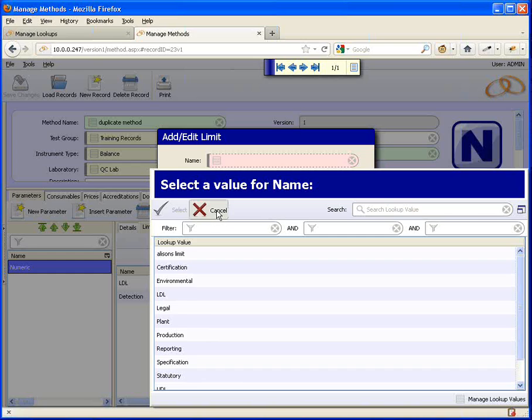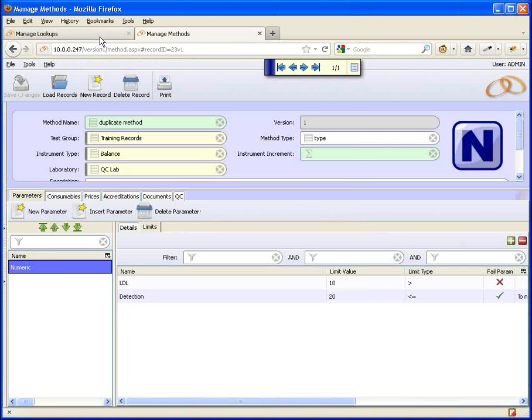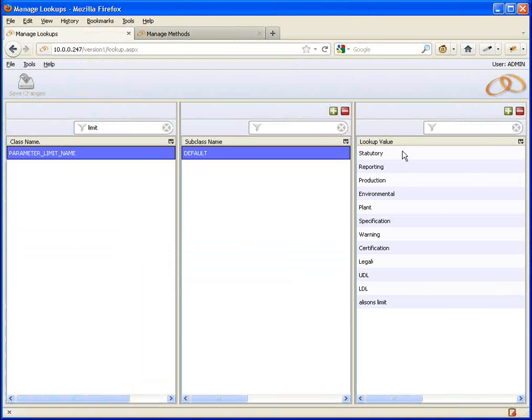What you can't do in here is highlight one and edit it. So if you find a typo or you wanted to replace one, I better delete that one, you have to actually delete it and then recreate it in the form that you want it.